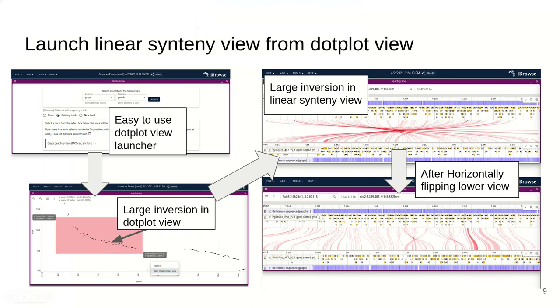I can click and drag to select this region and it will launch a linear synteny view, where we can see that same large inversion with an hourglass shape. Importantly, you can flip this entire view, which will give you the inversion kind of straightened out. Then you can see the smaller sub-inversions inside it. This is just an example of the type of workflow that people analyzing different genomes may want to work with.